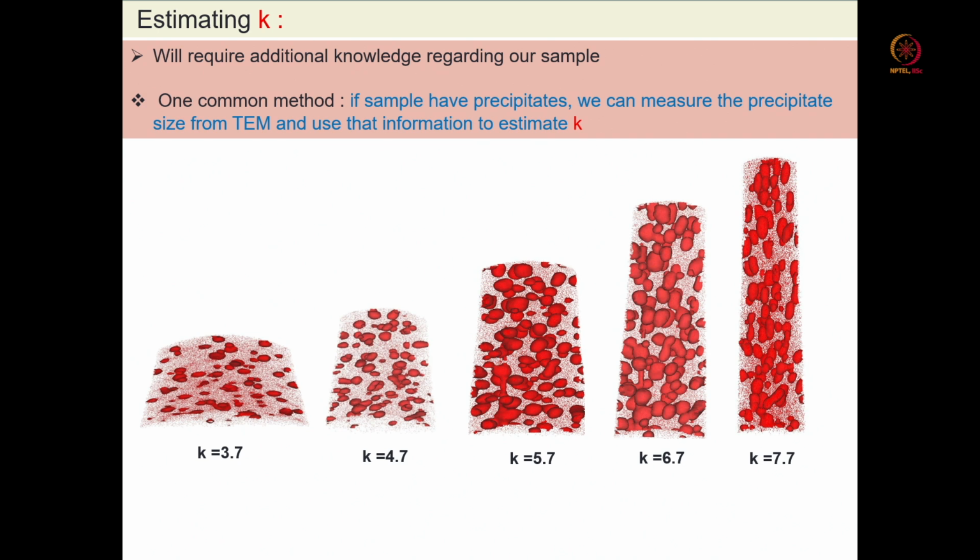This is just an example, an iron chromium alloy, where they get alpha prime precipitates. These are all BCC precipitates, and they know that these are spherical in nature by using alternative microscopy techniques. So in the iron matrix these are spherical precipitates.